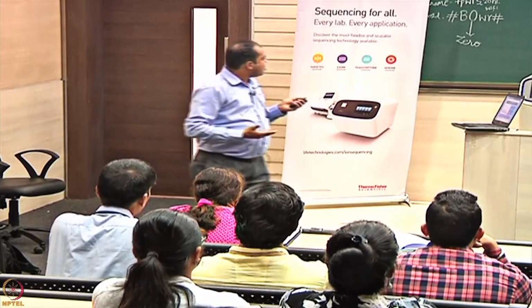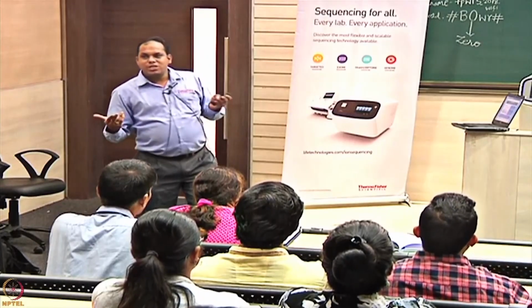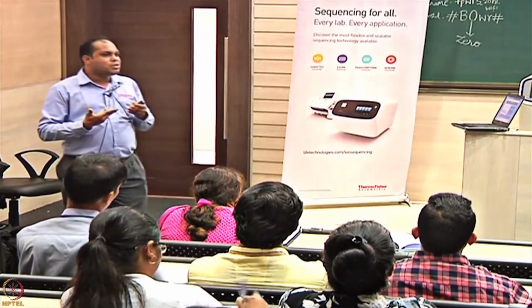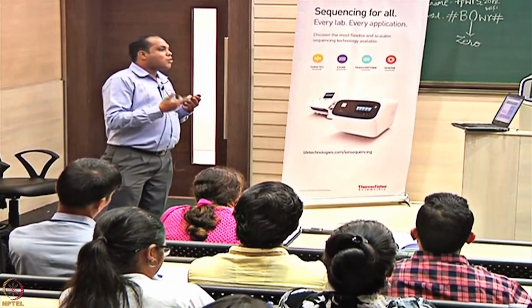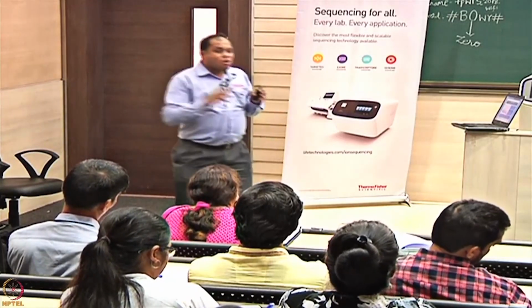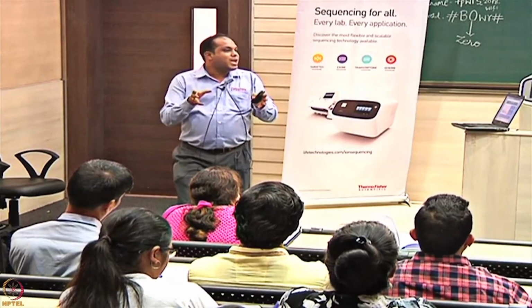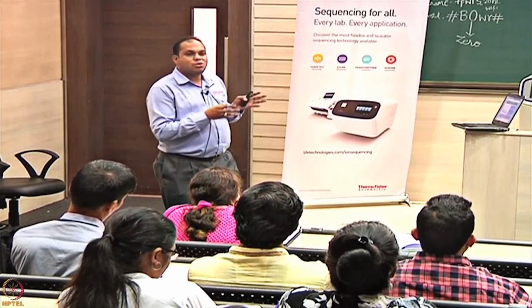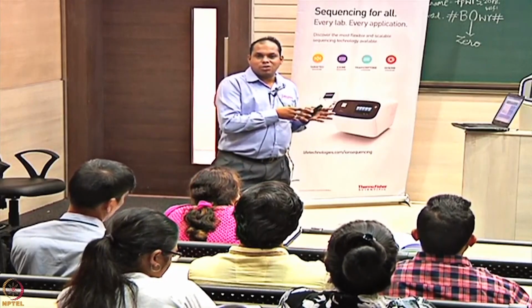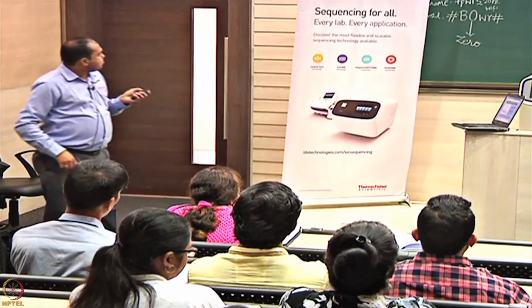Okay. So this is one of the studies, and the last one is something called gene fusion, where two genes can fuse at a particular location, at a point, and there could be a protein change happening in it. So such types of designs could be made readily available, which could be taken up further for sequencing on Ion Torrent technology. Okay. So I'll just move forward.